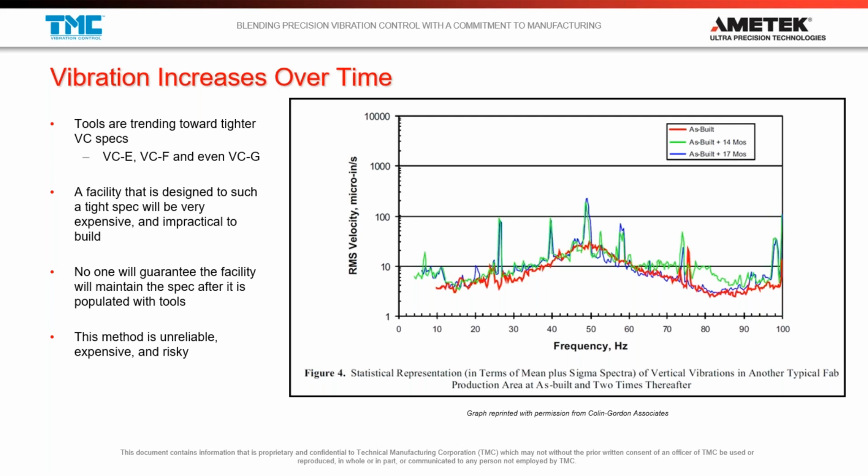But what happened was they went back about 14 months later and then 17 months later and took the same measurement and noticed an order of magnitude increase at various frequencies, especially at low frequency, where we start to see the building being populated by people and by other equipment and things that are starting to introduce vibration. So the point is, you can never really rely on your vibration conditions always being the same over time. It's natural for it to increase, and it's always going to increase.